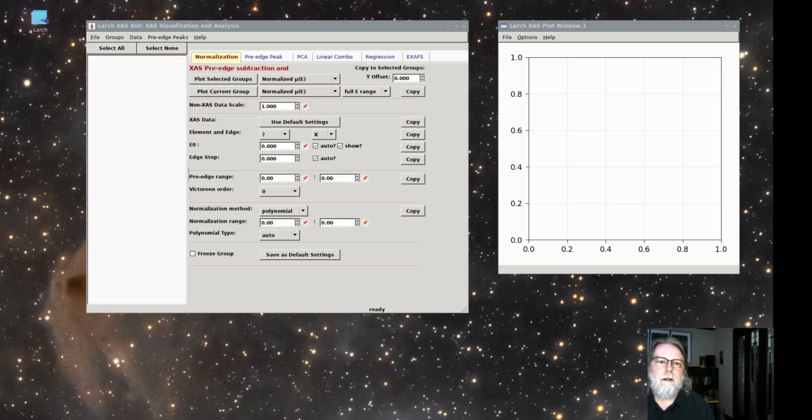Again, from a chemical spectroscopic perspective, this turns out to be the case quite often, though maybe not always and maybe not to extremely high precision. Still, spectroscopically, this common observation means that we can ask, what are the chemical species that make up this spectrum, and reasonably expect to get the right answer.